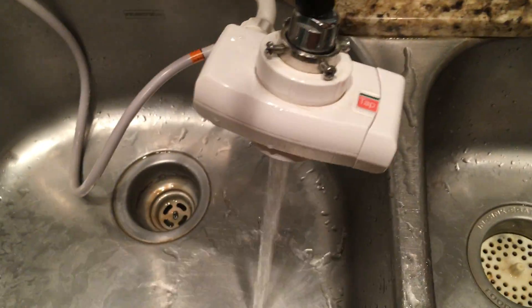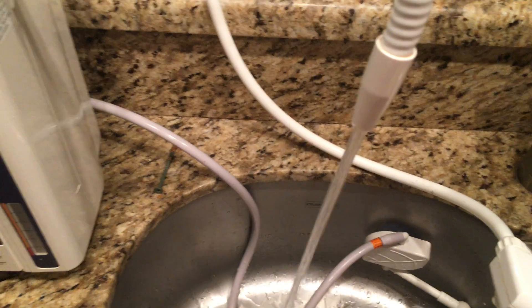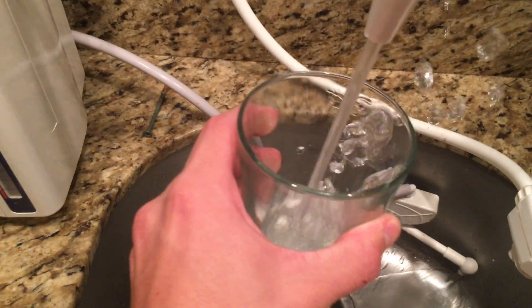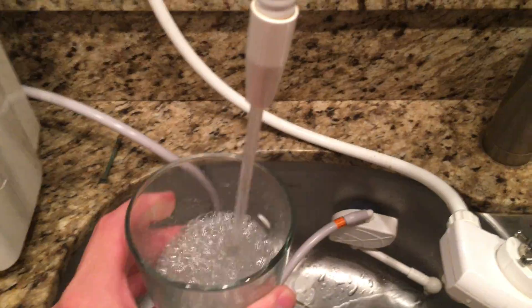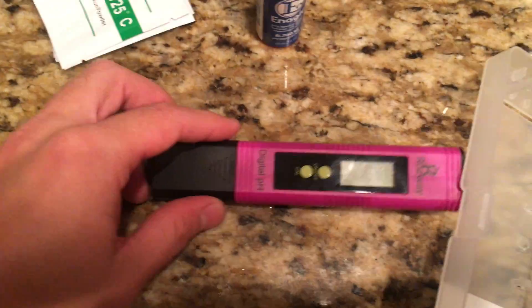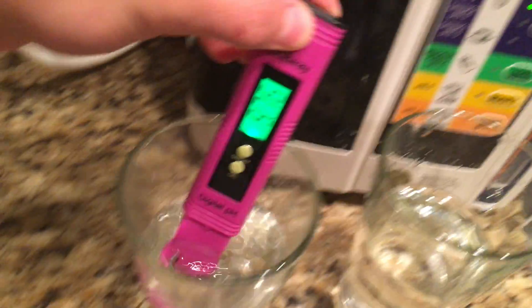First things first, turn on the water. Now this product is pretty simple to use. You just turn it on right there, remove the cap, and you just dip it in.